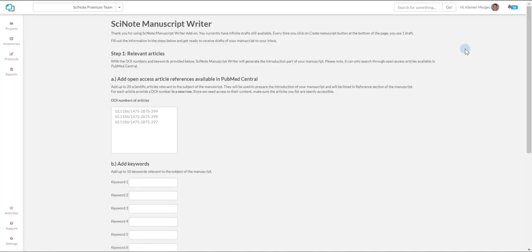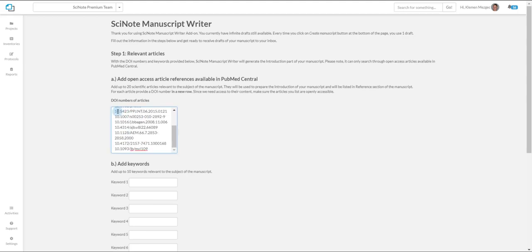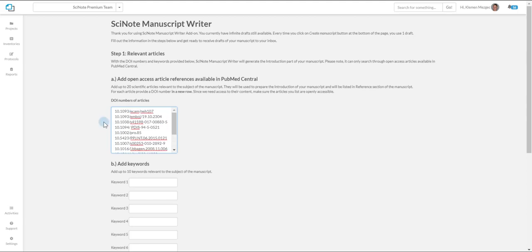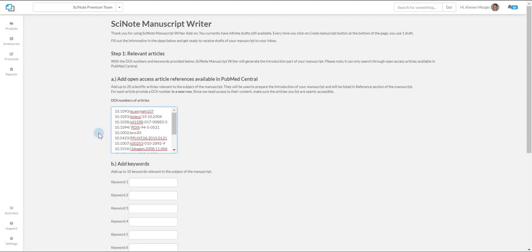First, write down your open access article reference numbers. They are available in PubMed Central. You can add up to 20 articles, and bear in mind that every number has to be in a new row. Be advised that used articles are openly accessible. They will be used to prepare an introduction of your manuscript, and they will be listed in the reference section of the manuscript.